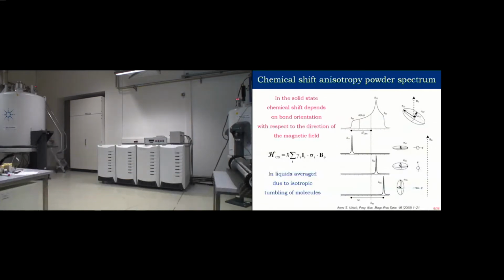So some systems, even if they have degrees of freedom, for example in the methyl group and the CH2 groups joined to the main axis, like in polymers, sometimes in a crankshaft motion, can be described as an averaging, but this is not at all. This averaging is only in one direction or two directions sometimes. So this is not isotropic averaging.